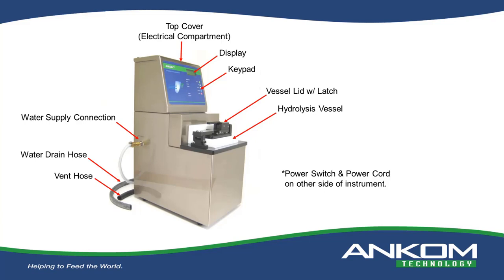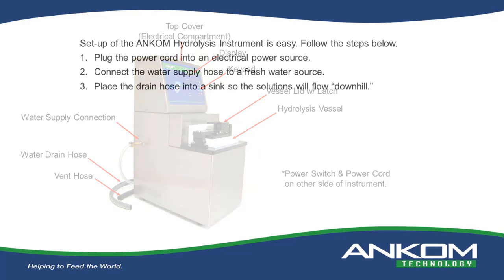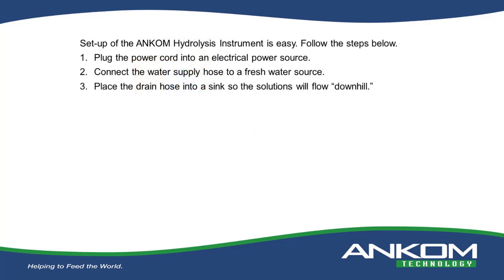To set up the hydrolysis instrument is really quite simple. First of all, plug the power cord into an electrical power source. Next, connect the water supply hose to a fresh water source. And then finally, place the drain hose into a sink so that the solutions will flow downhill, and ensure that the end of the hose is not underwater.